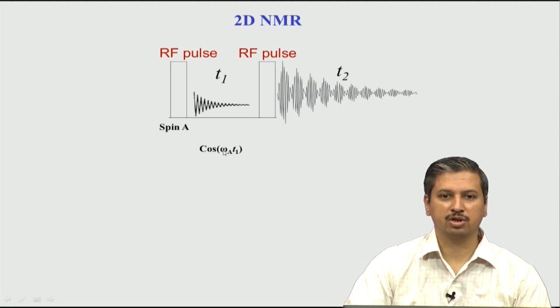But now coming to this part here, A is this spin A. So, we are talking about the chemical shift of one spin A, and T1 because we call this part T1. This is just a mathematical notation to label this variable. It is a variable, means it is varying, and therefore we call it T1, one T, and the second T is T2.